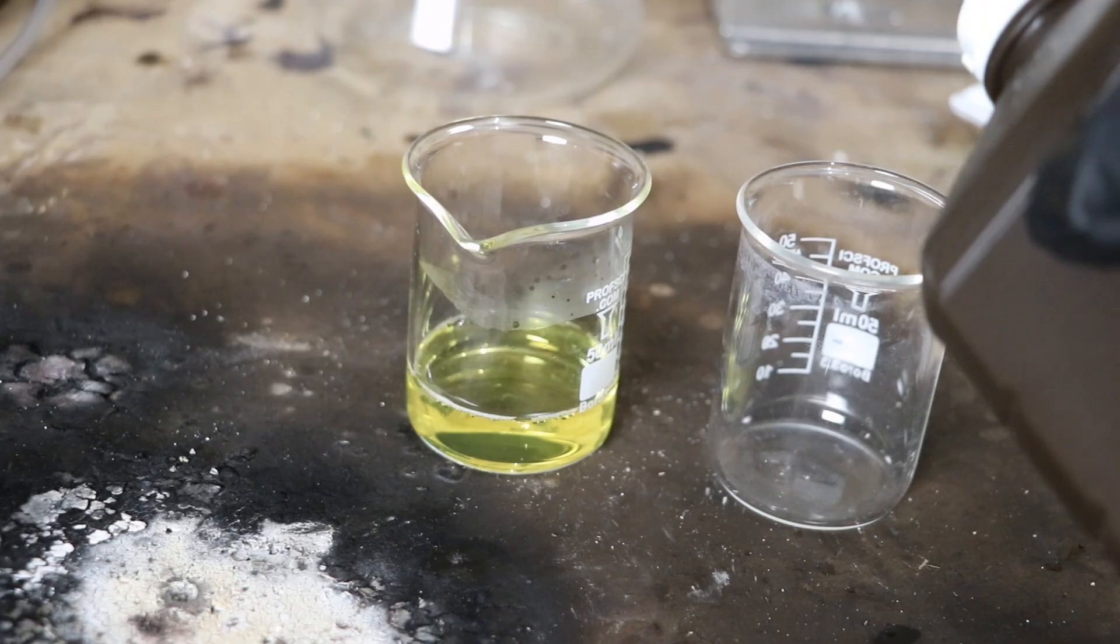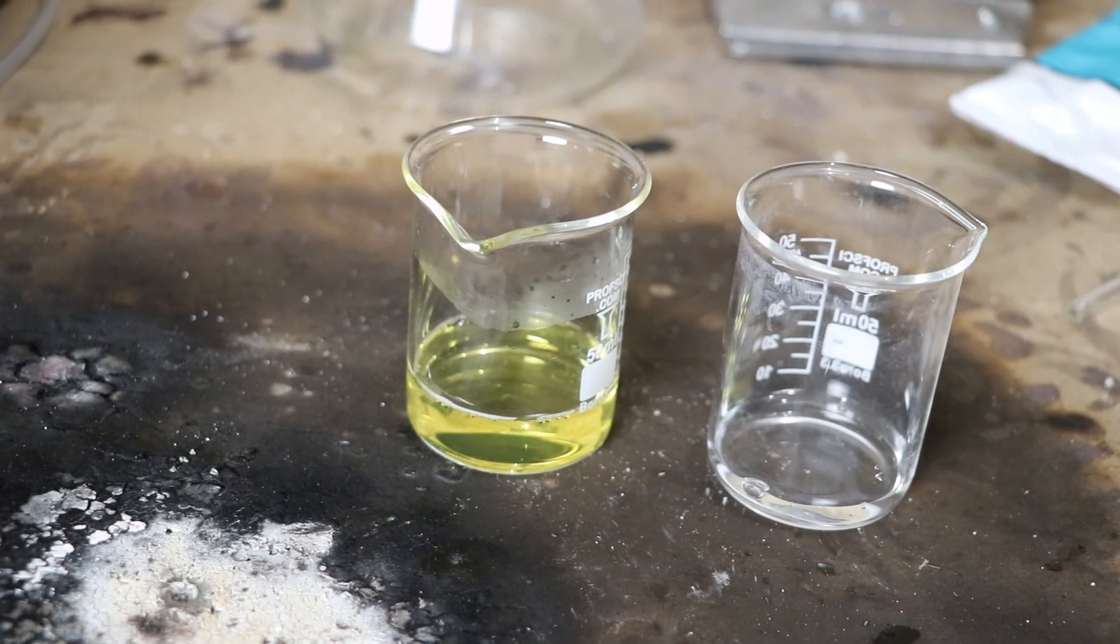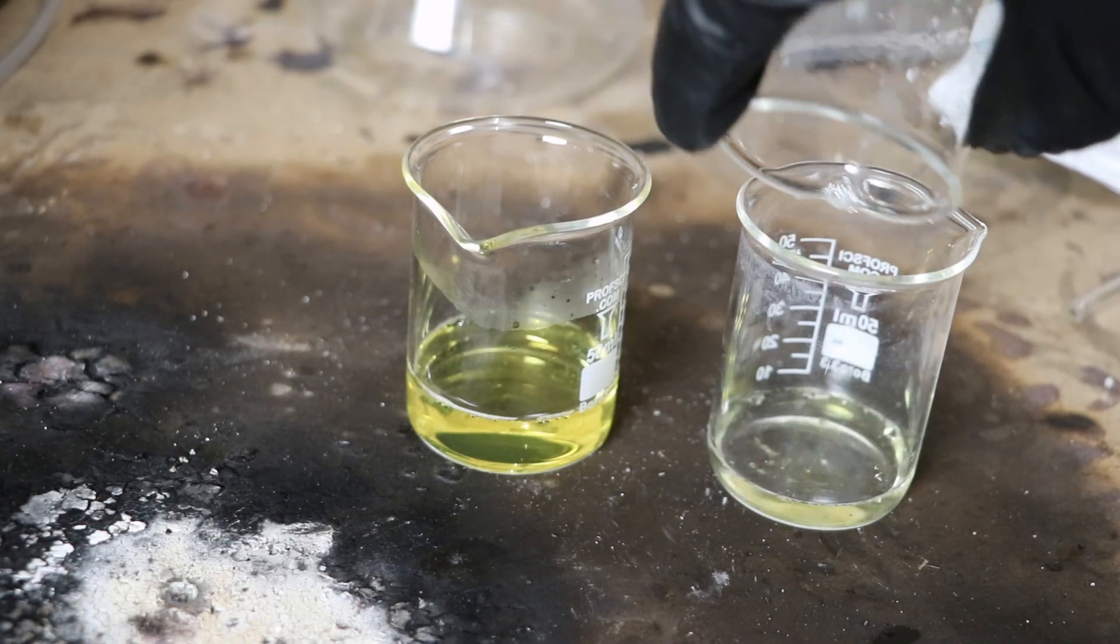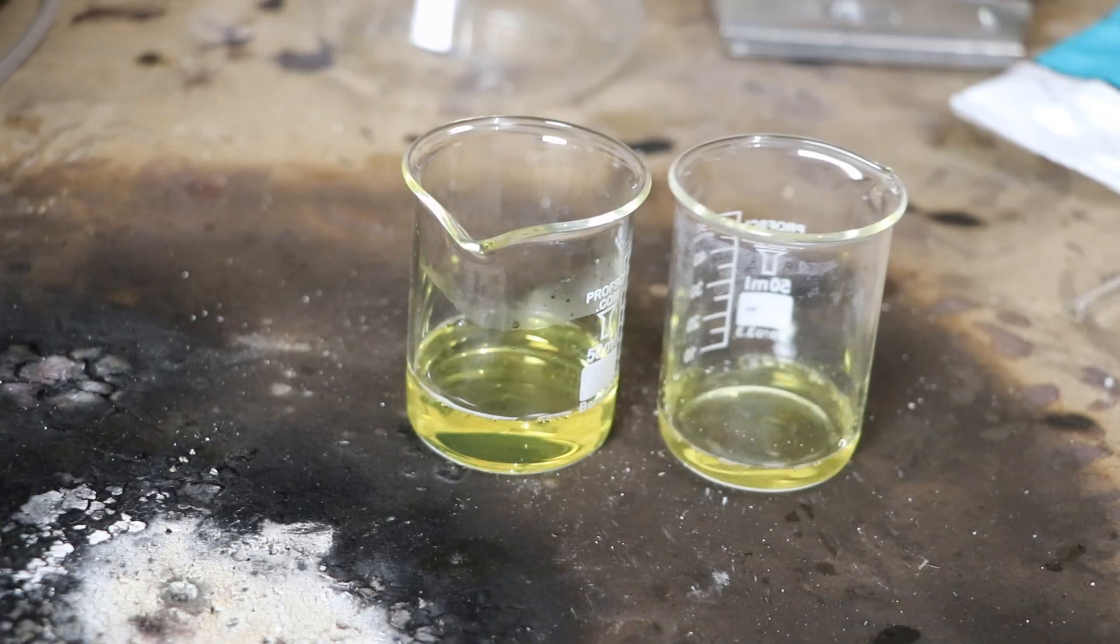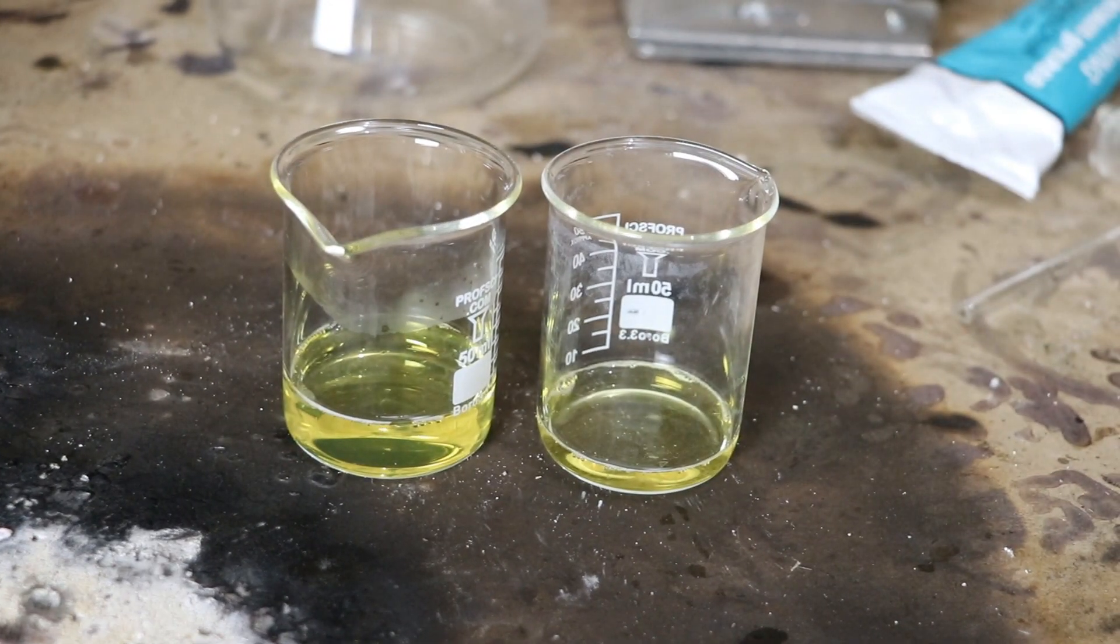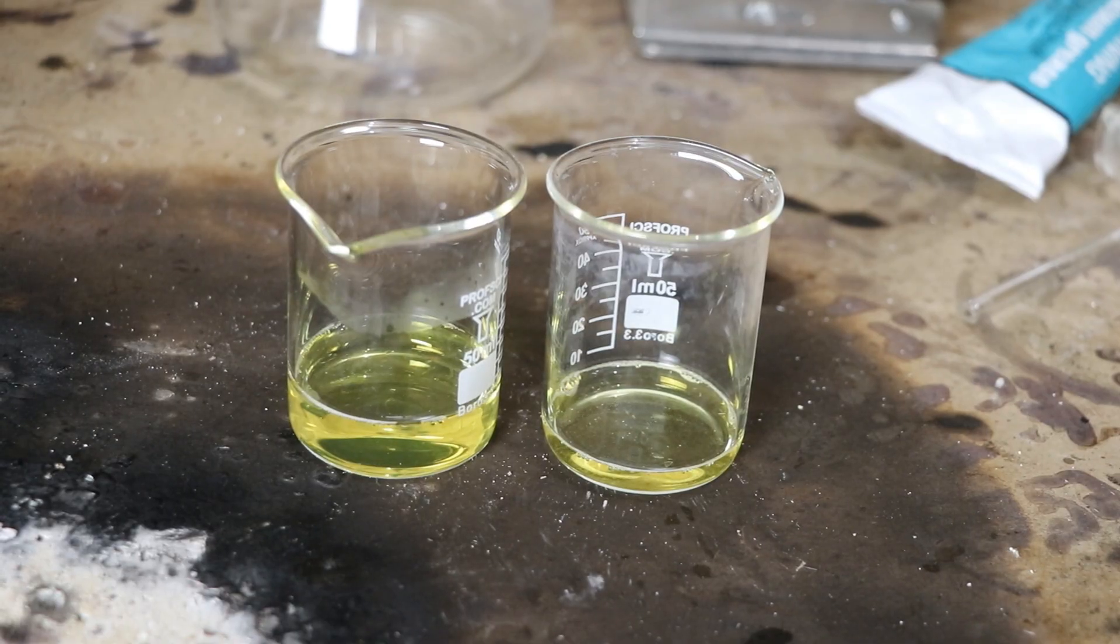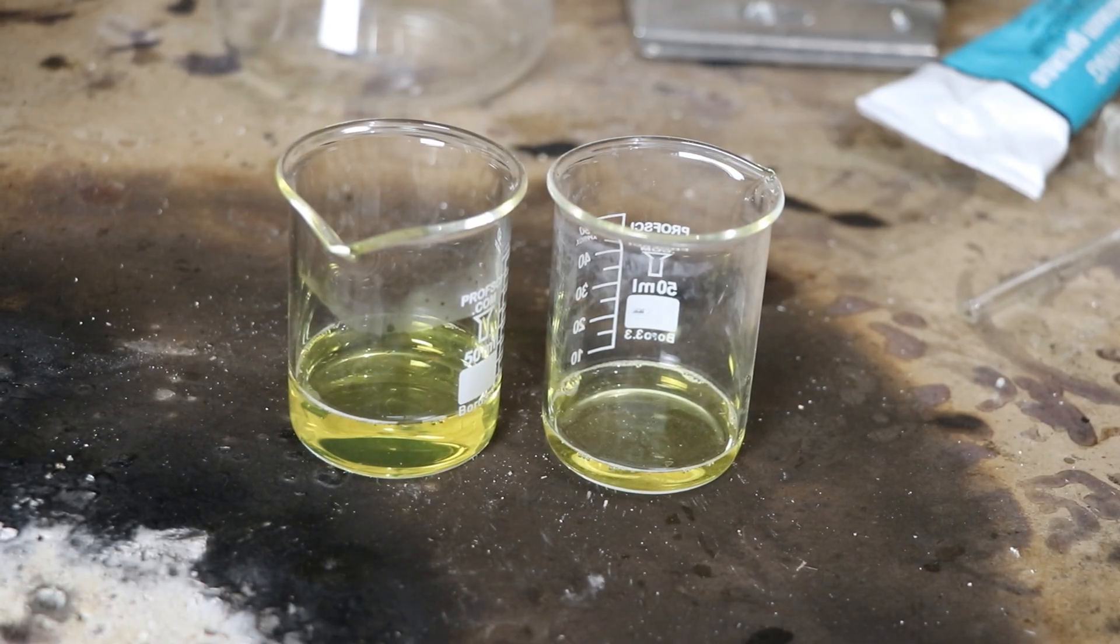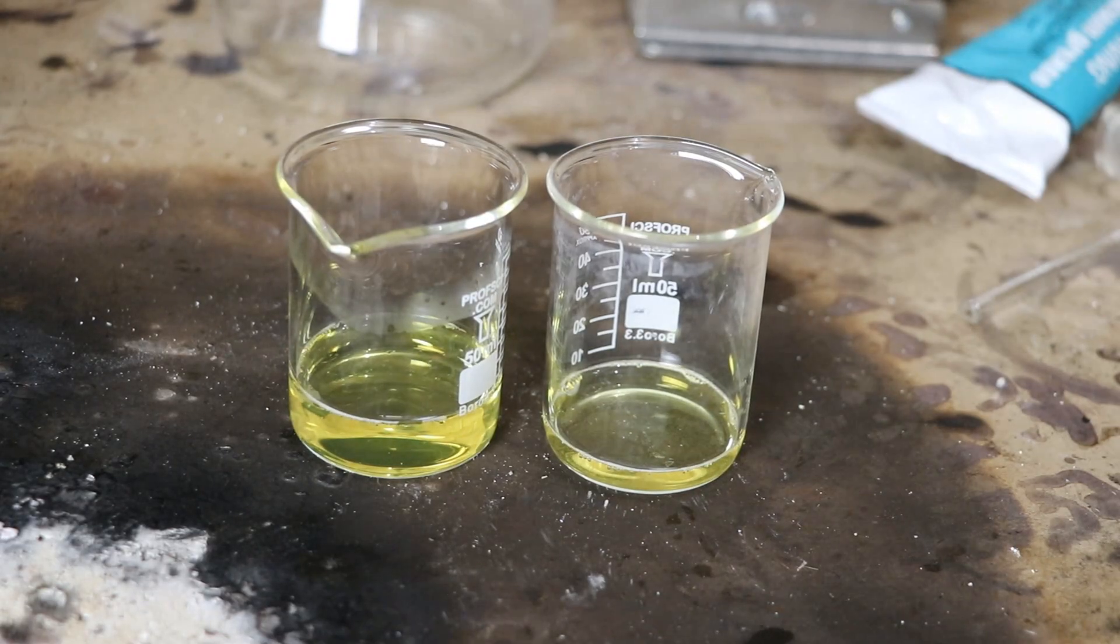So here's some three percent drugstore peroxide. Let's do the same thing to it. I got a little bit left here. Okay. Same color change. That one's not foaming up either. Okay. So that means there's something wrong with my test. Maybe the peroxide's just not strong enough. Uh, I'll go break open an alkaline battery. Let's use manganese dioxide.